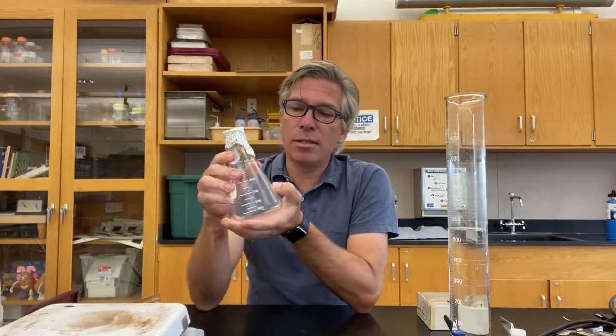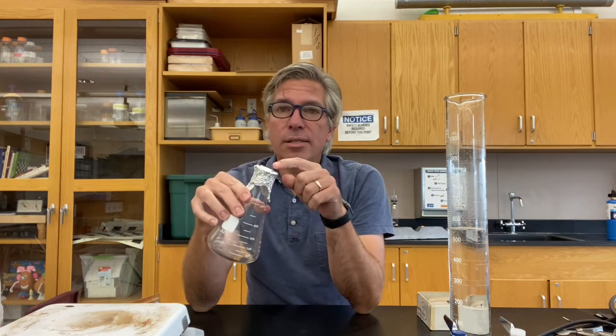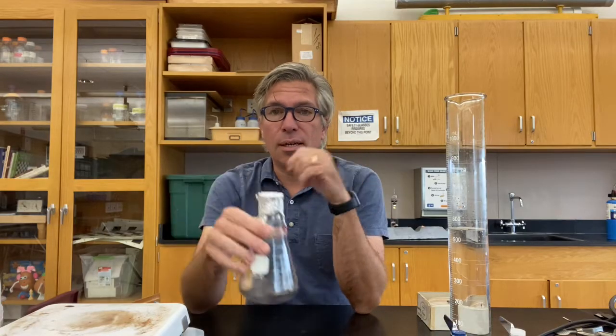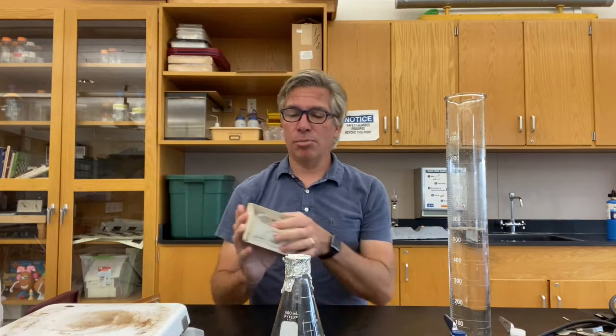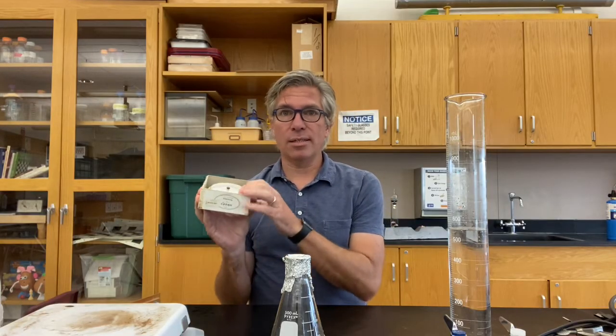The last thing we need to know about our vapor is the pressure of the vapor. And the nice thing is that since there's a hole in the aluminum foil, the pressure inside the flask is the same as the pressure outside the flask. And so if you have access to a barometer of any kind, you can very easily measure the pressure of the gas in the room as well as the vapor in the flask.